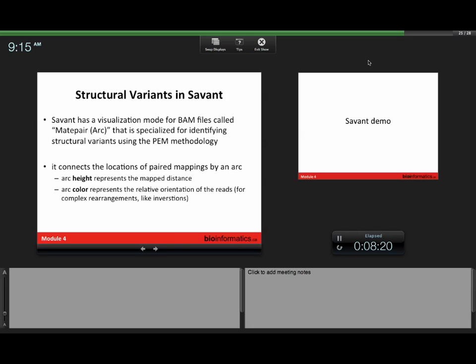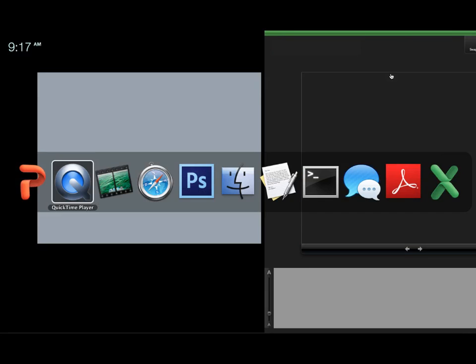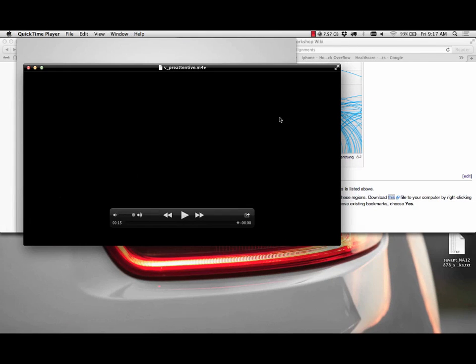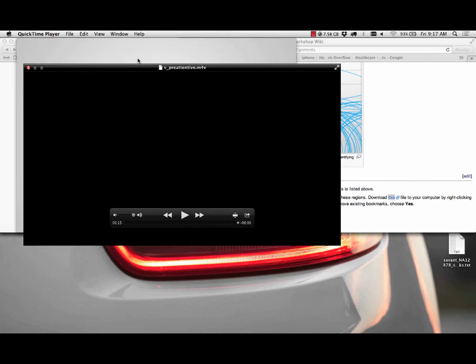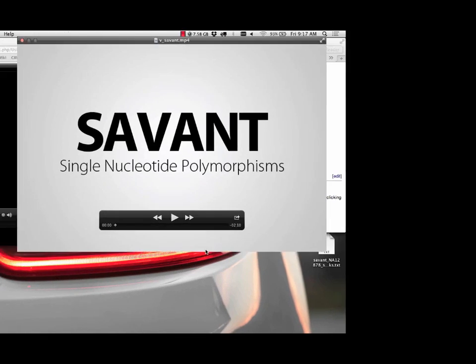Savant has this way of depicting structural variants or mate pairs in such a way that it makes structural variants pre-attentive. You shouldn't have to do much conscious work to be able to say that's a structural variant. Your job is then to interpret what kind of event it was based on the order and size of the mate pairs that are being mapped. What we do is we connect the two endpoints, so the first mapping and the second mapping, by an arc. And the height of that arc corresponds to how far those reads were mapped apart. If it's the case where reads map in different orientation than we expect, we also color them differently. So they're going to pop out in terms of color as well.